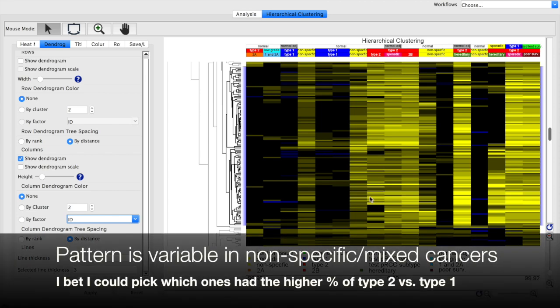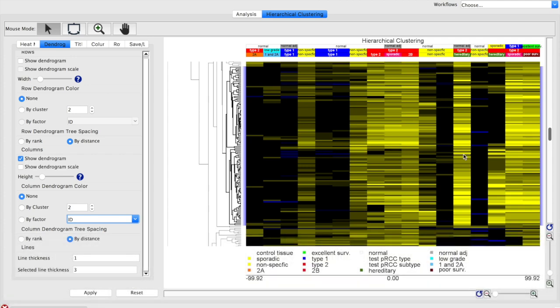And you can see that in these three columns, the expression is very, very high, which is also confirmed in our last two columns, again, which is comparing the more severe types to the less severe forms of the cancer. So again, we're getting confirmation not only with the cancer versus normal tissue, but also the cancer versus cancer.